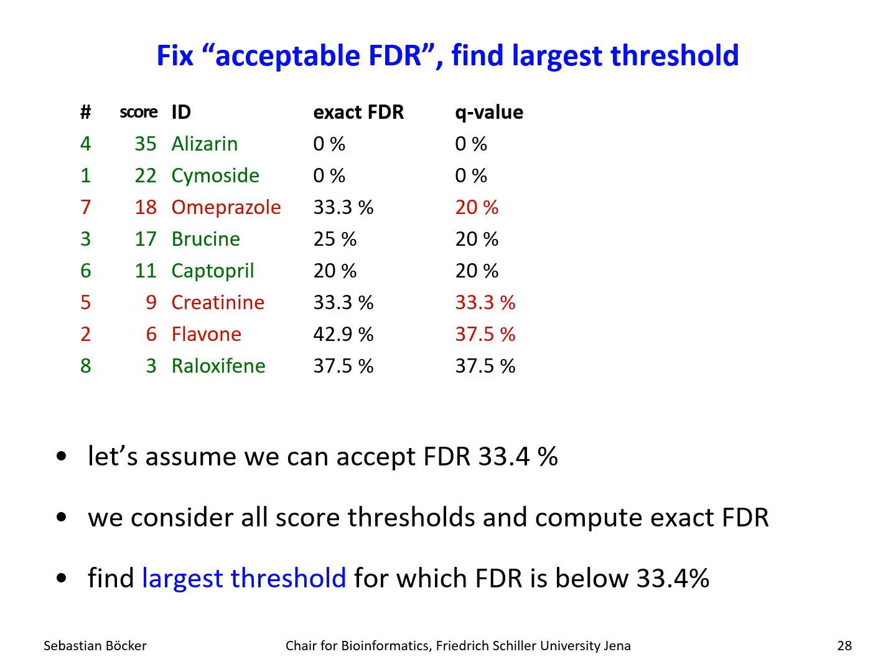So in application, we would assume that somebody has given us some FDR threshold, such as 33.4%. That's obviously a toy example, but otherwise we can't really show it with these few hits. And then we would search for a score threshold so that this FDR is held. We know the exact FDR. And since the FDR can get smaller again, we search for the minimum score threshold, the lowest score threshold, so that this is held, so that we are reporting as many correct hits as possible. So here are actually the FDRs for all the corresponding score thresholds, which are slightly below that.